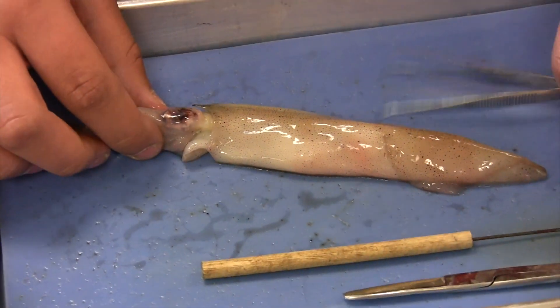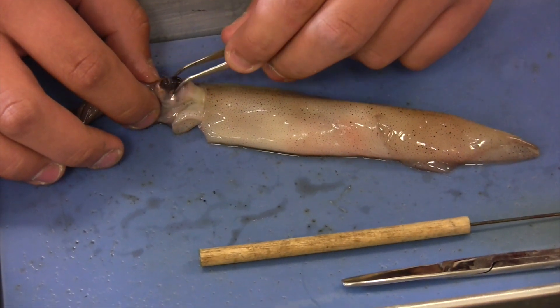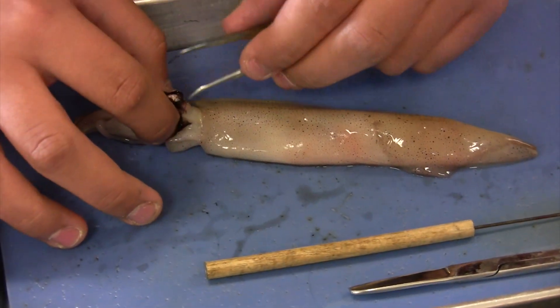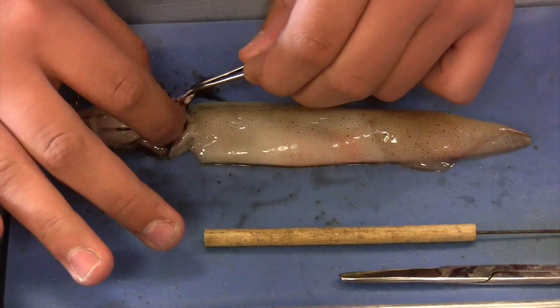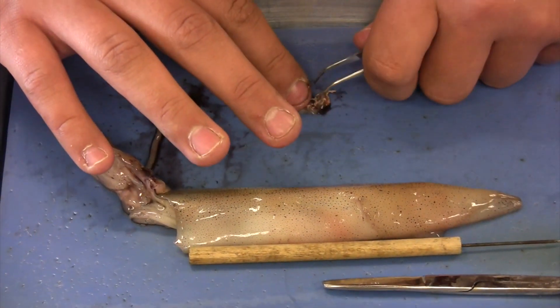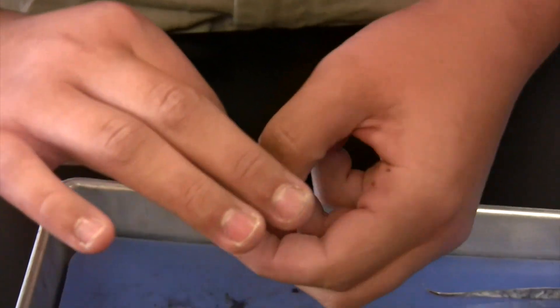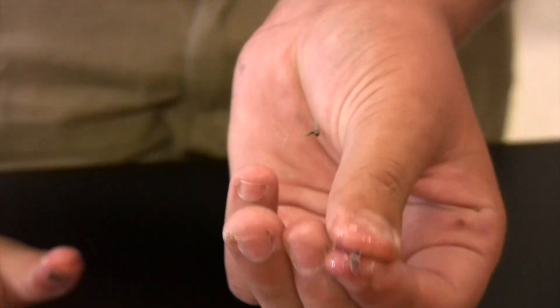Now liquid's pouring out, so that's a sign that you cut into it. The lens, which we're going to take out, is like a small ball almost. You can kind of feel it — it's a hard little ball. So I just pulled out the eyeball, which is right there. And then the lens is in here. The lens is right there — it's a very small little ball. And that is how you extract the lens from the eye.